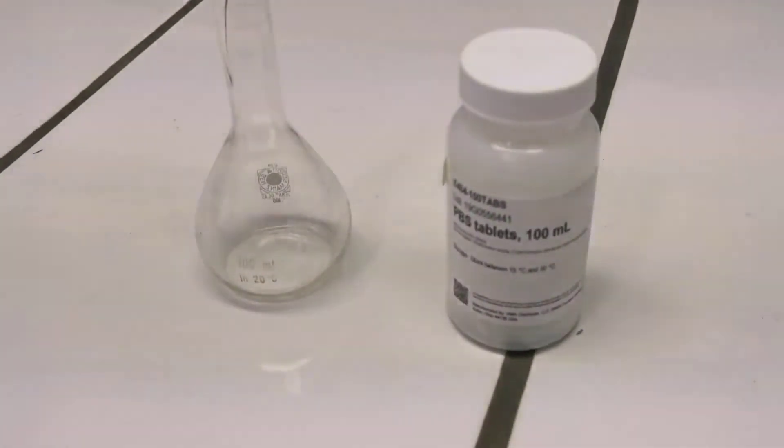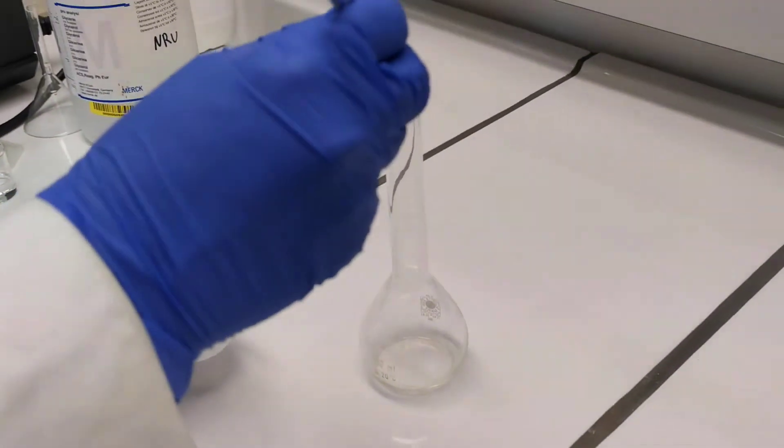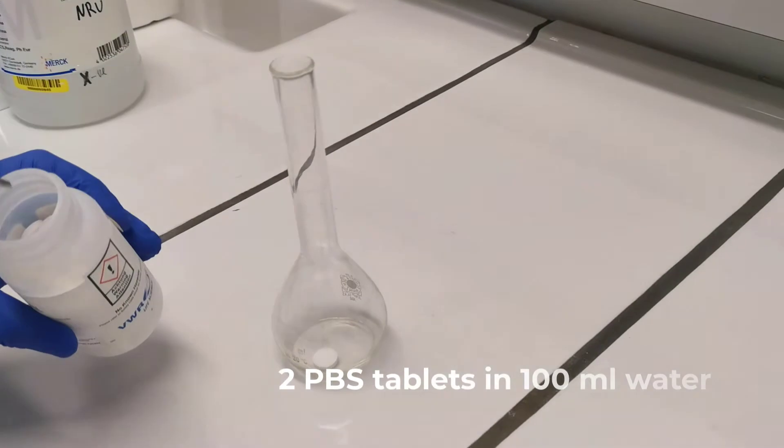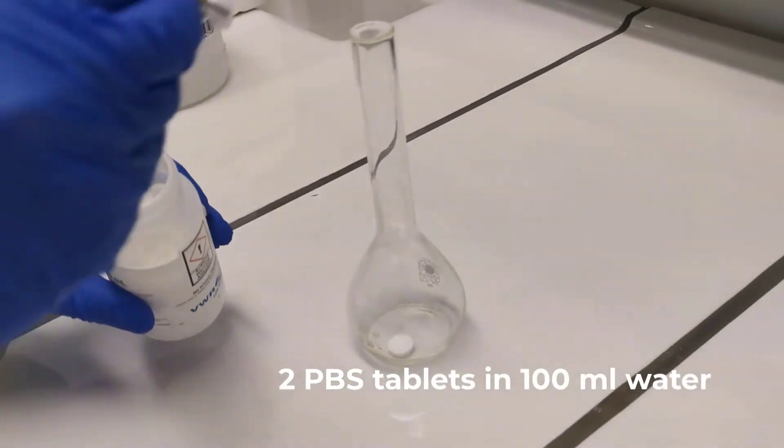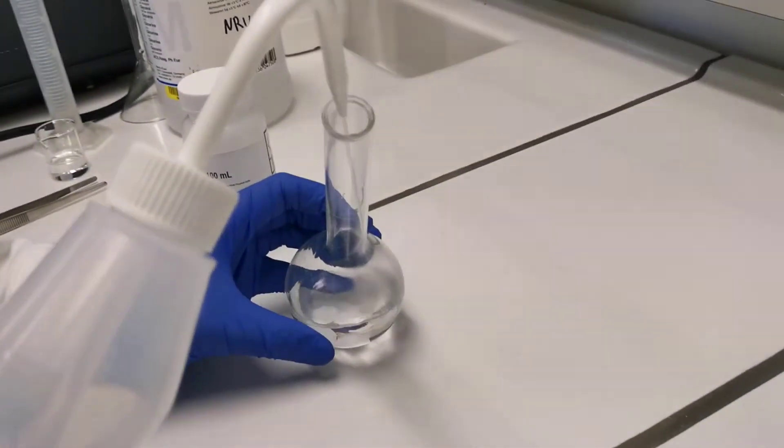It is now time to prepare some phosphate buffered saline, or PBS. You can get PBS as tablets. For us, we need two tablets to dissolve in 100 milliliters of distilled water to get 2x PBS.